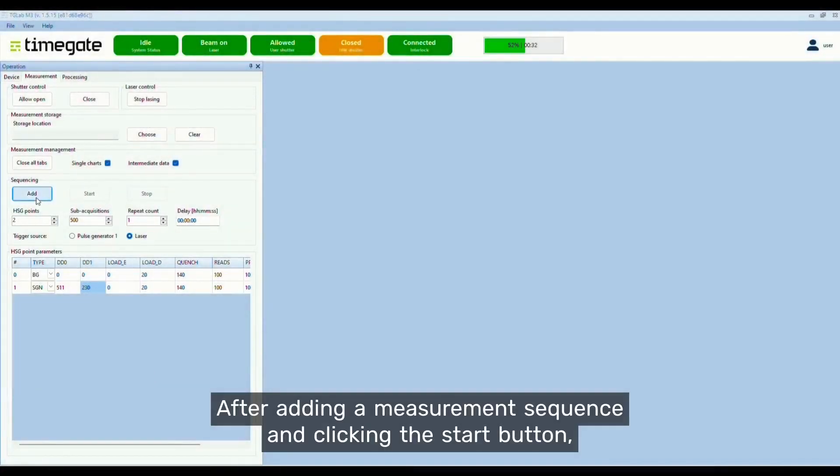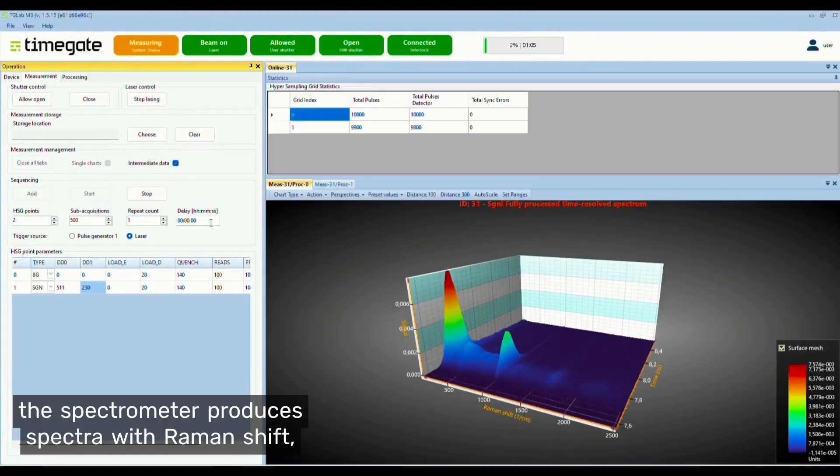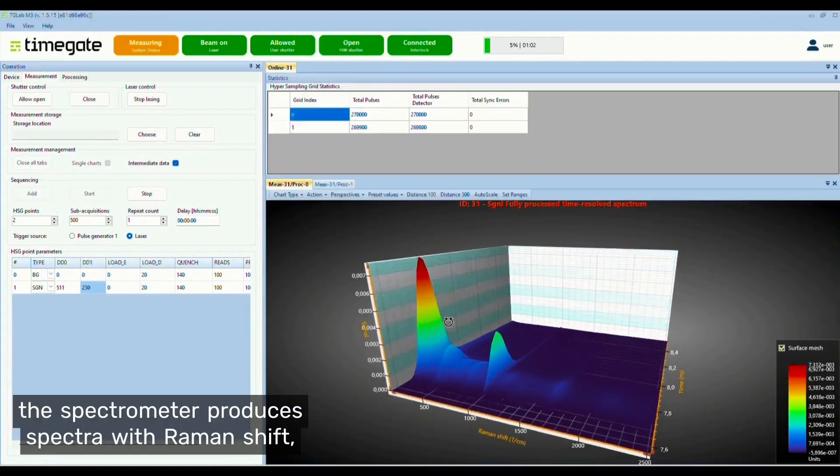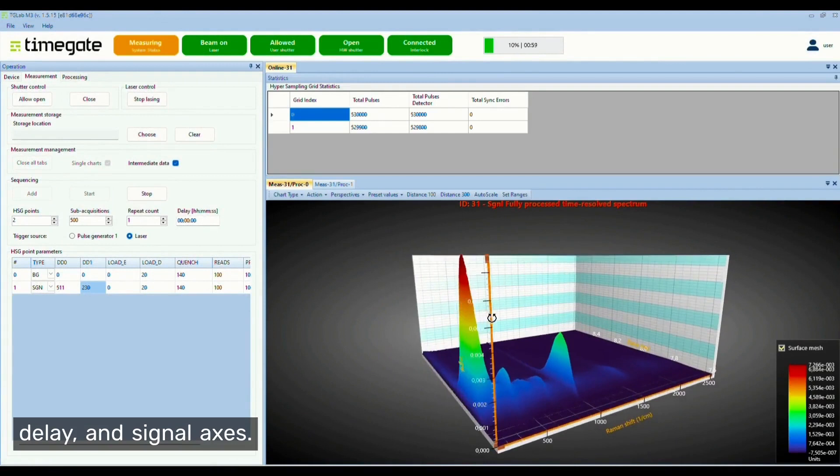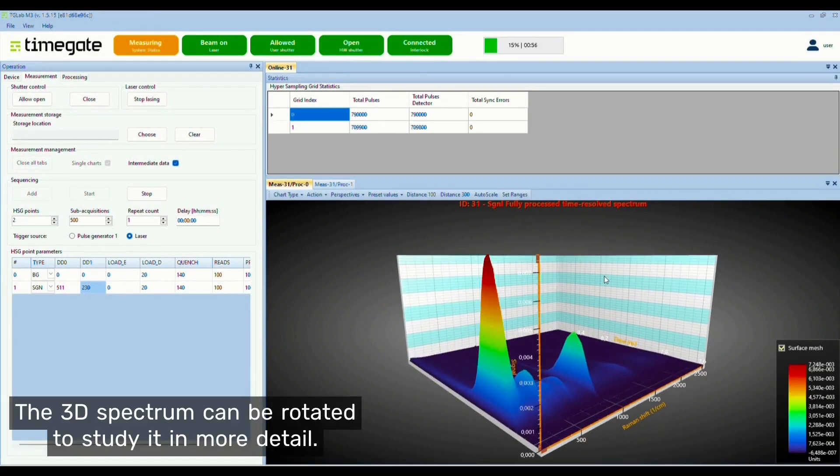After adding a measurement sequence and clicking the start button, the spectrometer produces spectra with Raman shift, delay, and signal axis. The 3D spectrum can be rotated to study it in more detail.